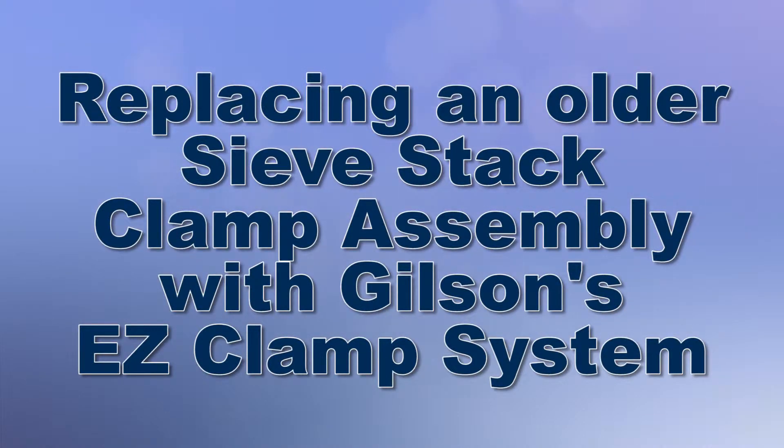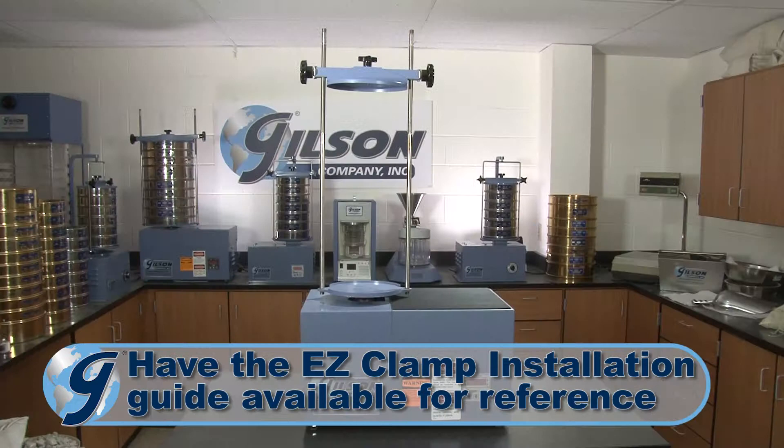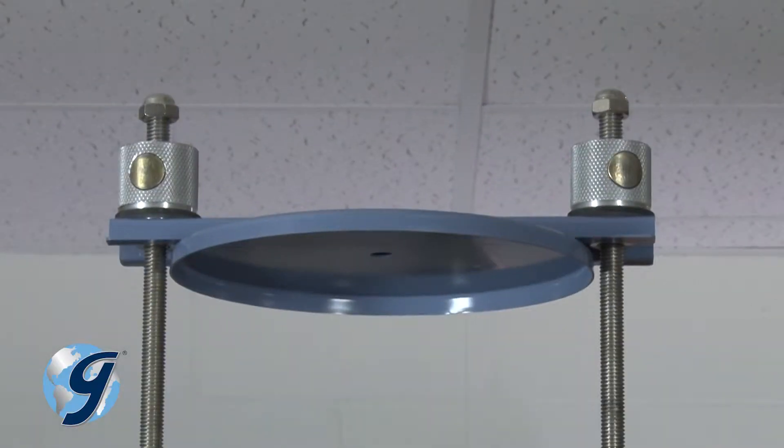Today we're going to demonstrate how to replace your existing sieve stack clamping system used on older Gilson SS8R tapping sieve shakers with Gilson's innovative and easy to use easy clamp system.